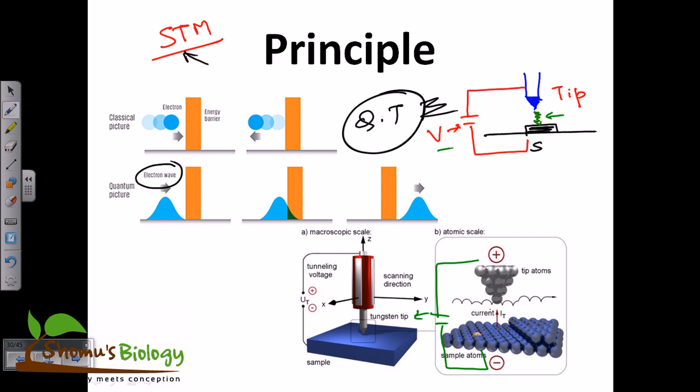Here you can see the voltage arranged there, right? So once you do that, the idea now is to detect the surface structure of the specimen, which is this one, right? So how could you do that? Now here is the idea. Let's say this is how the sample looks. For example, the surface of the sample looks like ups and downs, all the way like that.